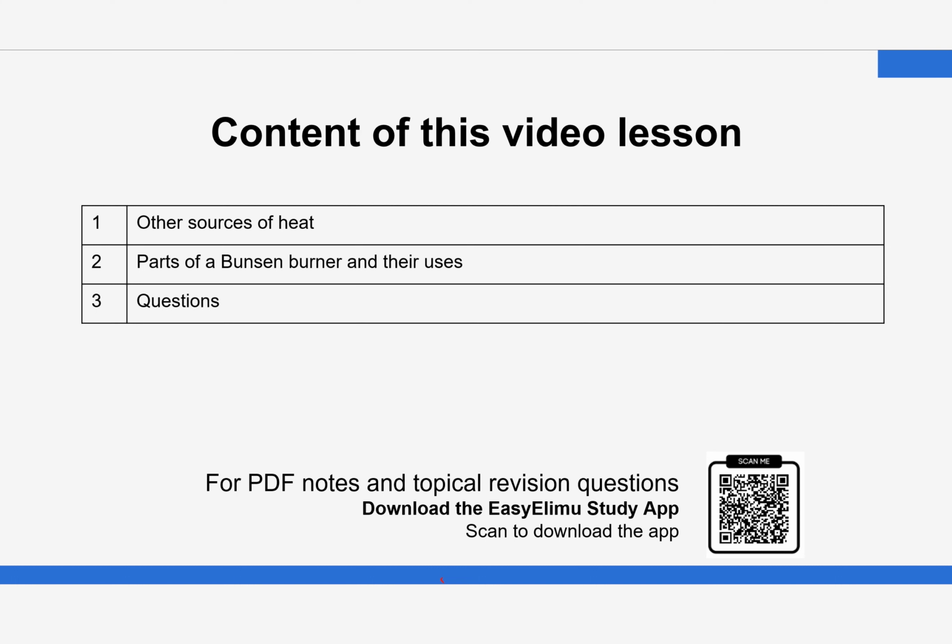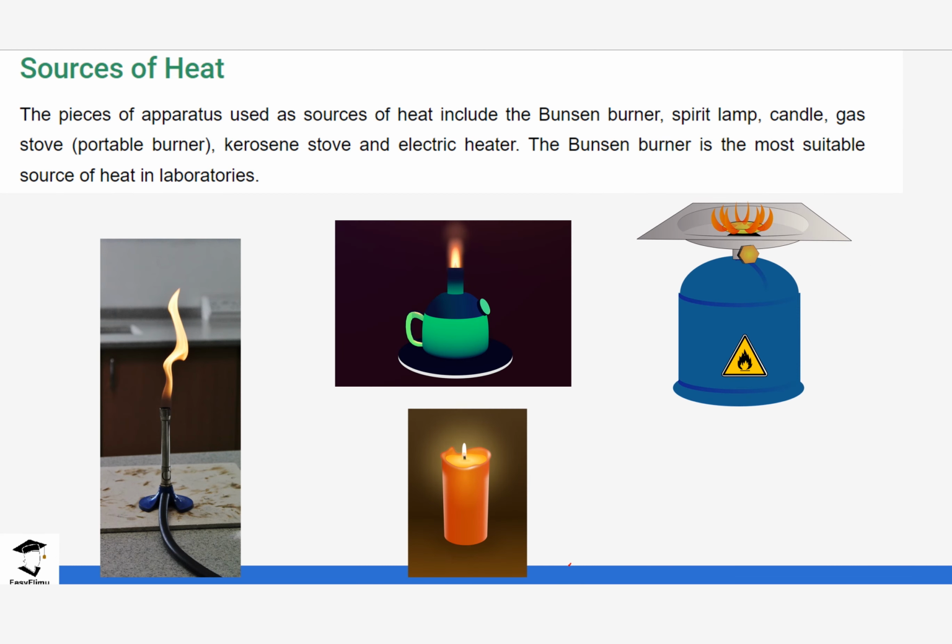And we are going to look at the parts of the Bunsen burner and its uses, and also focus on a few questions in regards to what we are going to discuss today. So let us begin. So in the laboratory, we do have sources of heat.